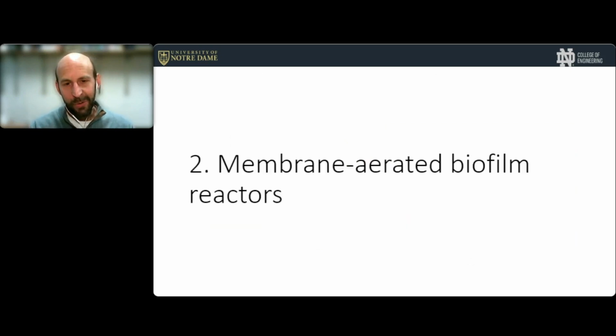Okay, so here's how we used it. One area of research that we work a lot with in my lab is membrane aerated biofilm reactors, or in general, membrane supported biofilms. So let me tell you a little bit about some research in this area.